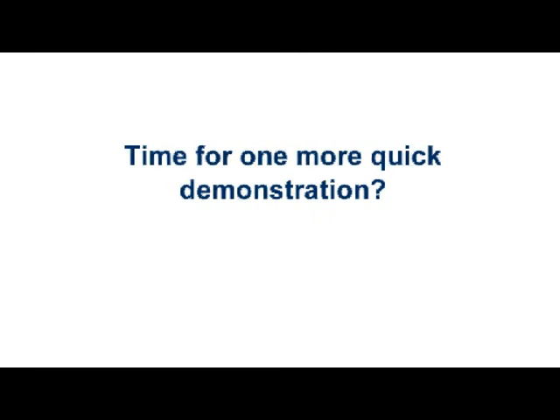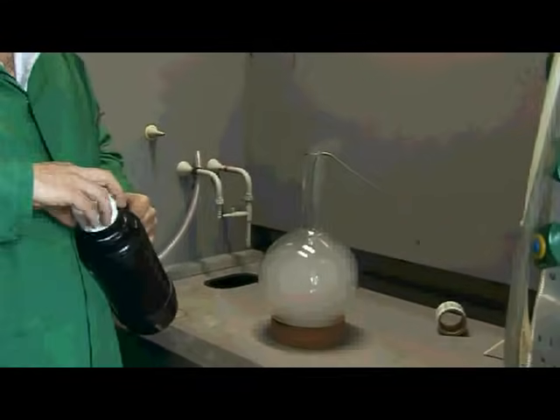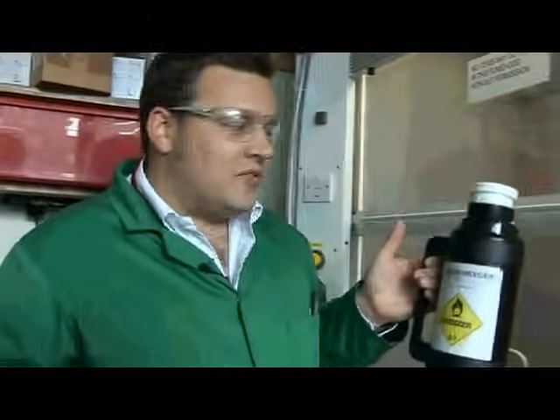We're doing something new here. What are you doing? Well, I've just filled up my vessel with some oxygen. This is liquid oxygen which we made for an earlier demonstration, and we've just used it to drive off all of the non-combustible nitrogen from inside this glass vessel. Look at all that oxygen floating around the bottom of that flask - that's really cool, all oscillating in. A really nice experiment.